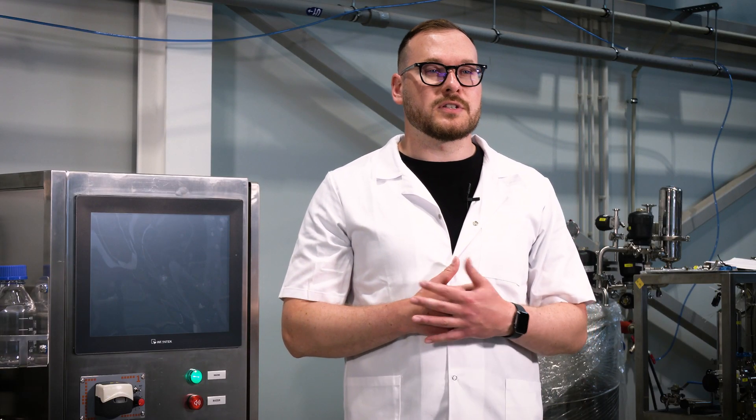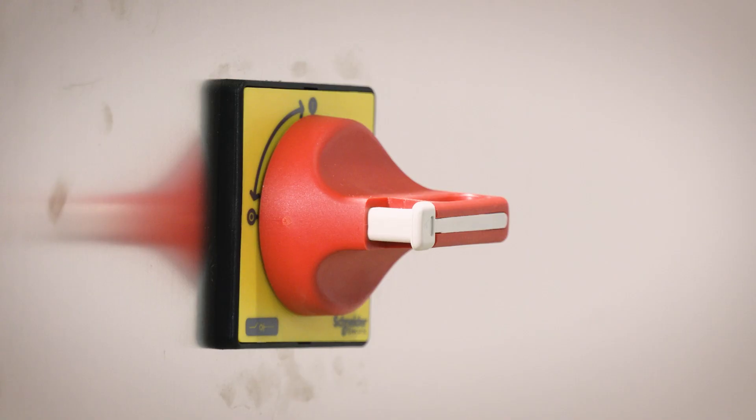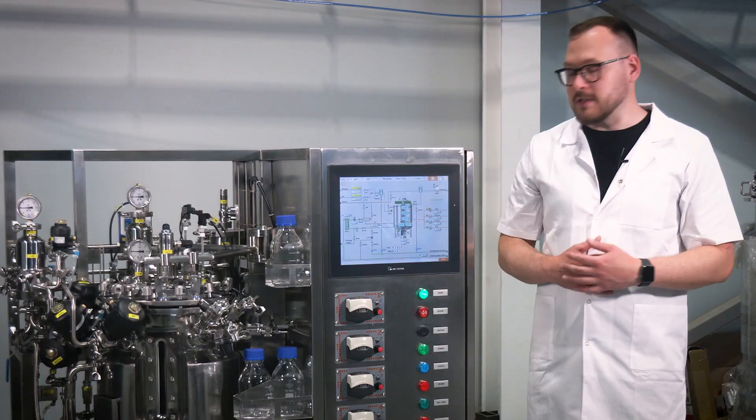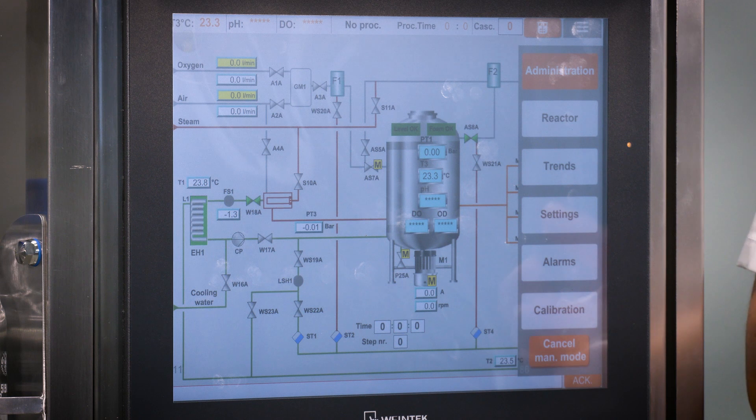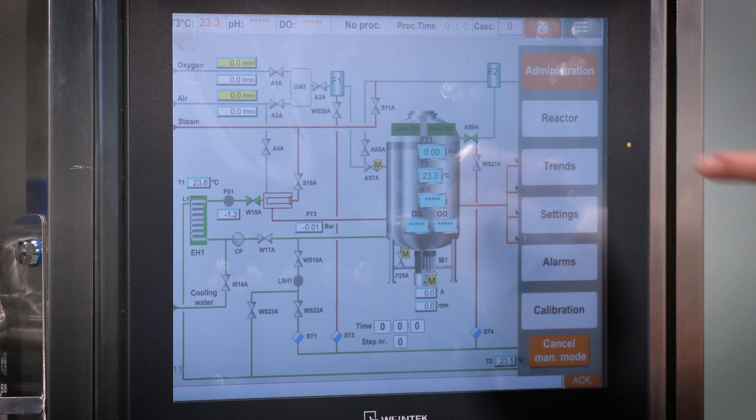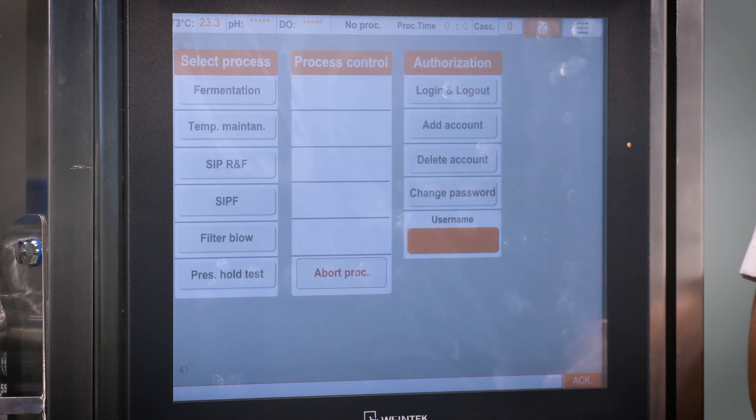To begin work with the bioprocess controller, follow the instructions. First, turn on the system by moving the on-off switch located on the right side of the control unit. Click on the menu button. Next, select administration, which will open the administration window.